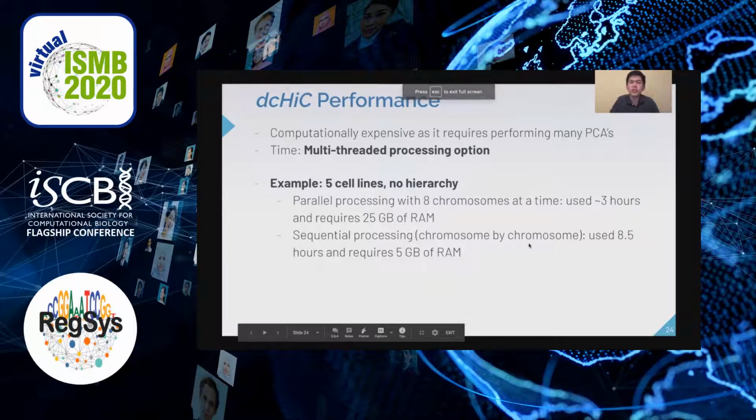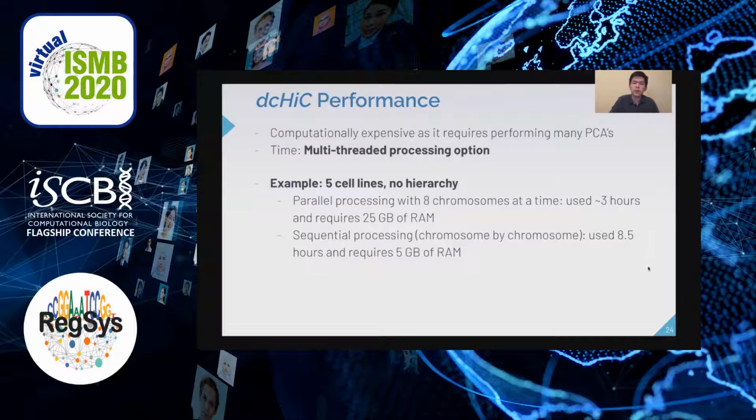Performance-wise, our application is relatively computationally expensive, as it requires performing many different PCAs in a multiple factor analysis. However, if time is an issue, we do offer a multi-threaded processing option. Below is one example of time and memory usage in one particular instance that it was run.